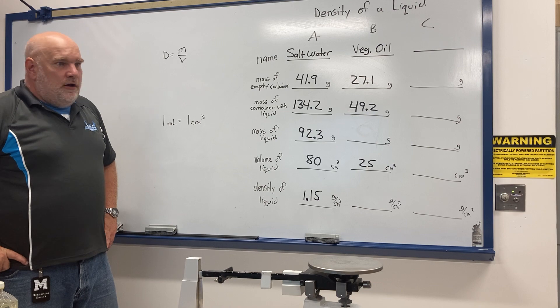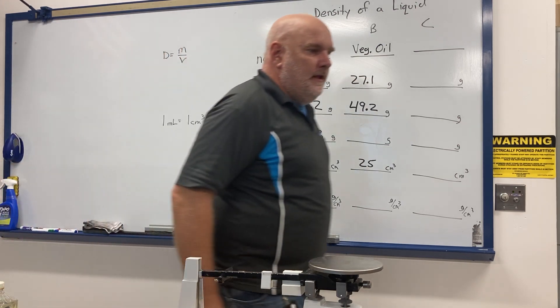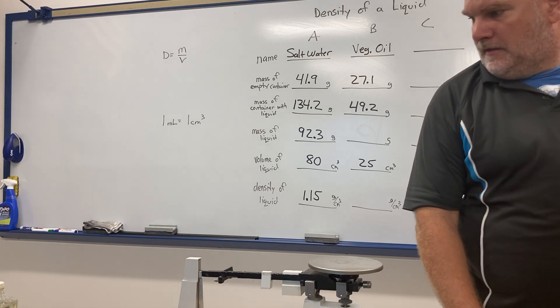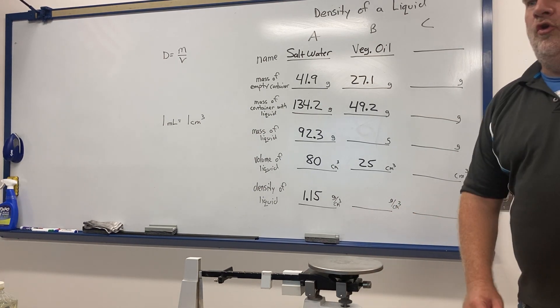The third liquid we're going to find the density of is something you're probably not as familiar with — a substance called witch hazel.